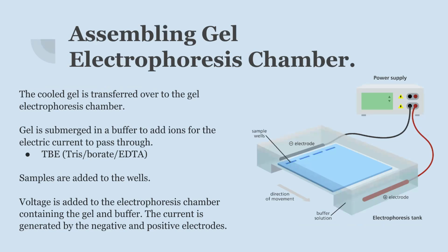And again, that buffer is going to be something called TBE, tris-borate and EDTA. Okay, and then the samples are added into those wells. And again, you're doing it very gently. You don't want to puncture anything. You want to go slow.